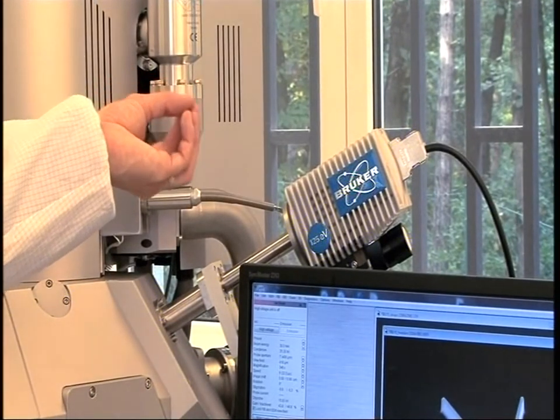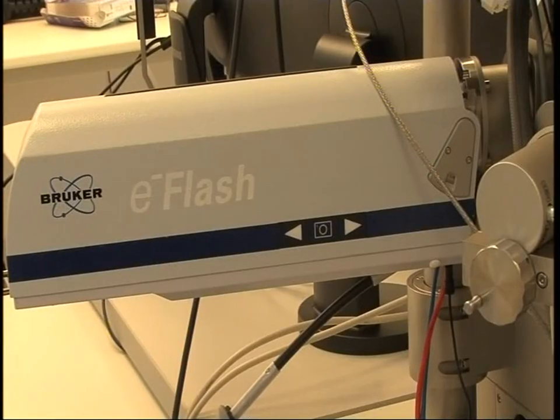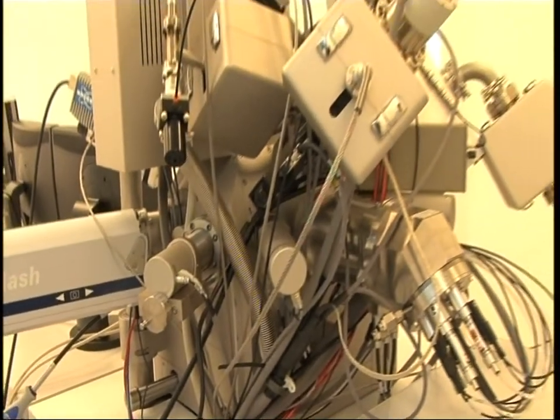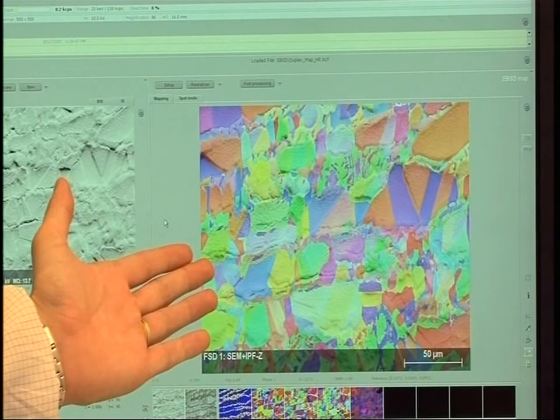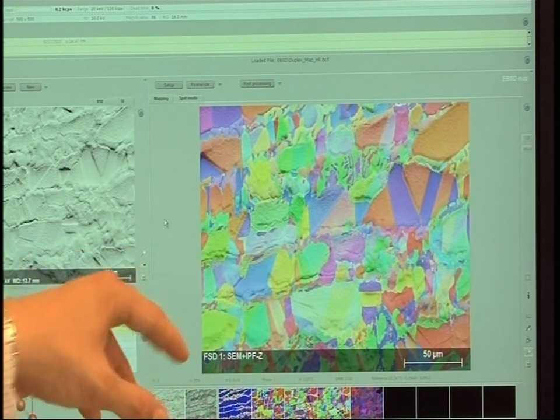Further, there is a device for electron-backed scattered diffraction. This allows us to identify the structure of our sample. For instance, on the sample of austenitic steel, we can see various grains. The same color refers to identical crystal structure of the grains.